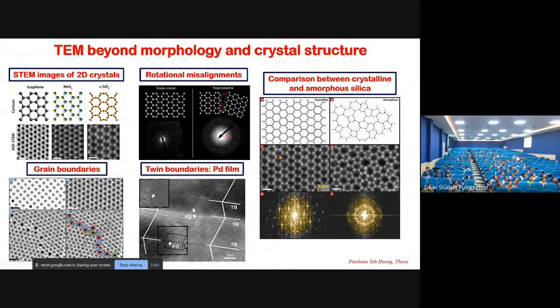These small parts are atoms. Taken by transmission electron microscopy, you can see how the atoms are arranged regularly and periodically in a crystalline material. So this is a direct image taken from a transmission electron microscope instrument, which costs about 10 crore rupees. This is the high-end version of your camera. Thank you, sir. Thank you once again.